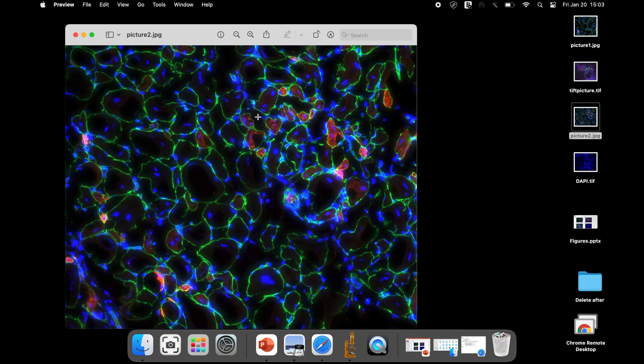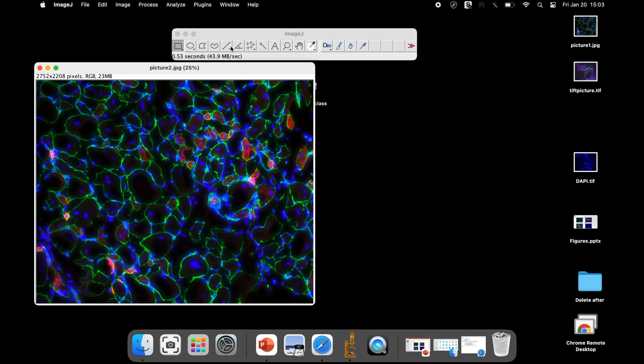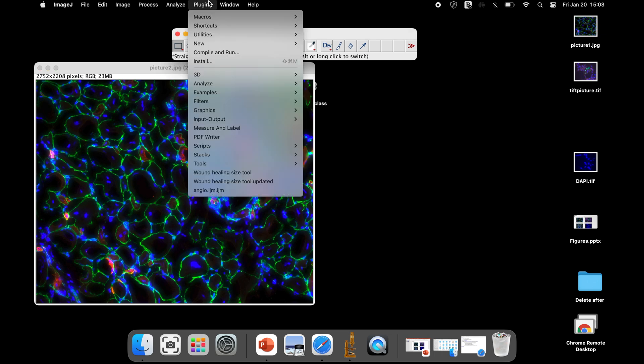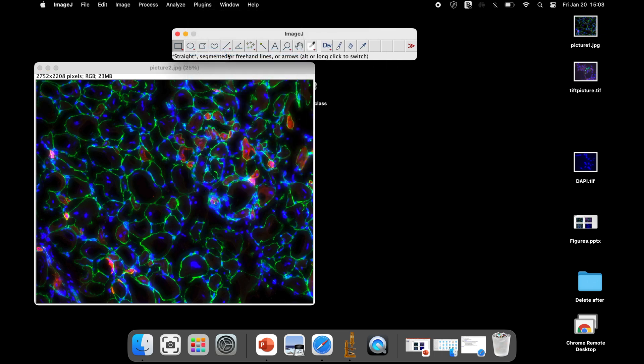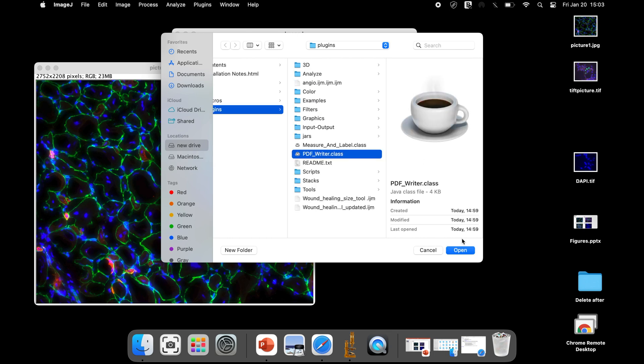Here is a JPEG image. Let us convert the JPEG format to a PDF format using the plugin that we just installed. Open the image in the ImageJ software. Then, click on Plugins, Compile and Run and select PDFWriter.class from the Plugins folder and click Open.